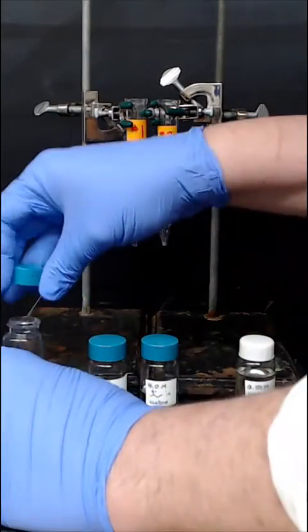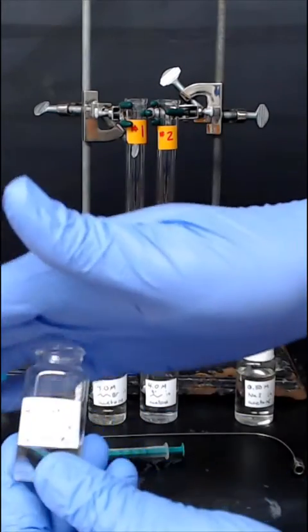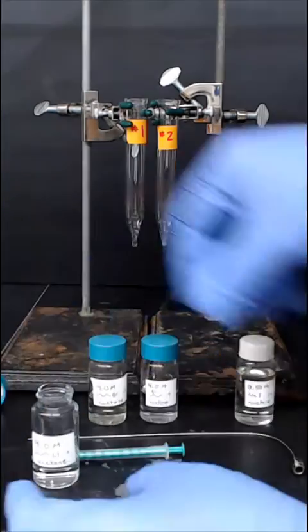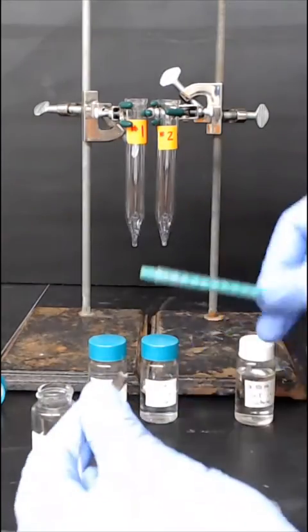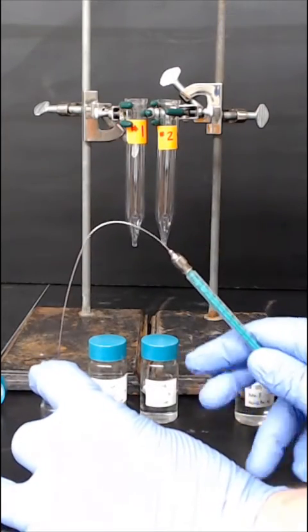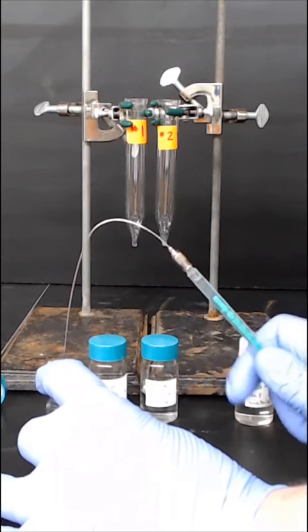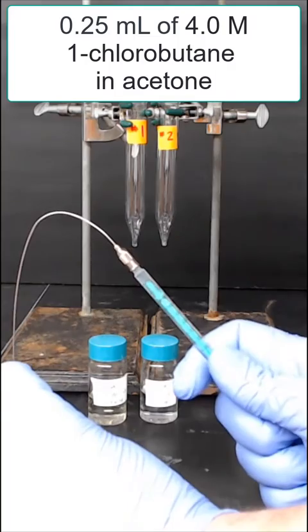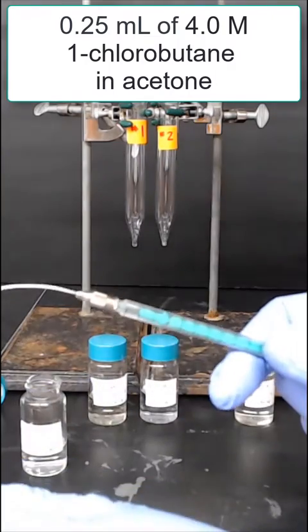The first reagent that we'll use is a solution of four-molar, one-chlorobutane in acetone. Here we're using a syringe and needle with a big J-hook. These are useful because it'll allow us to turn the syringe upside down and push out the air bubble that comes in the syringe barrel. We're dispensing 0.25 milliliters of our four-molar, one-chlorobutane in acetone solution.